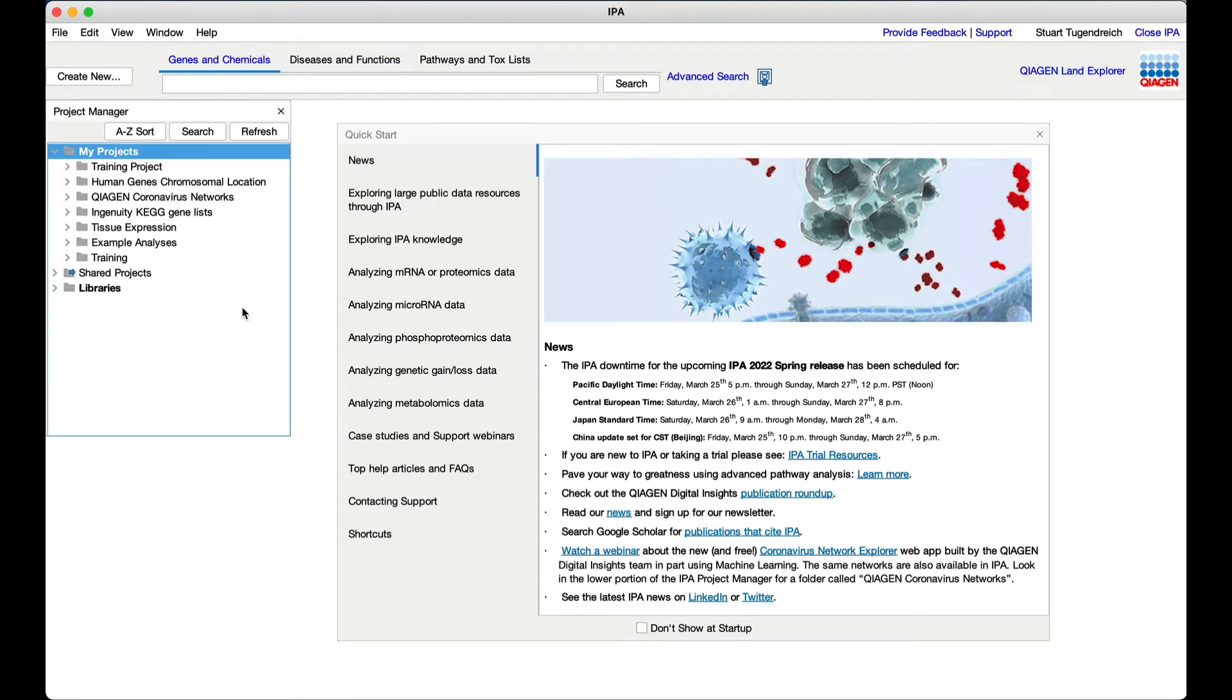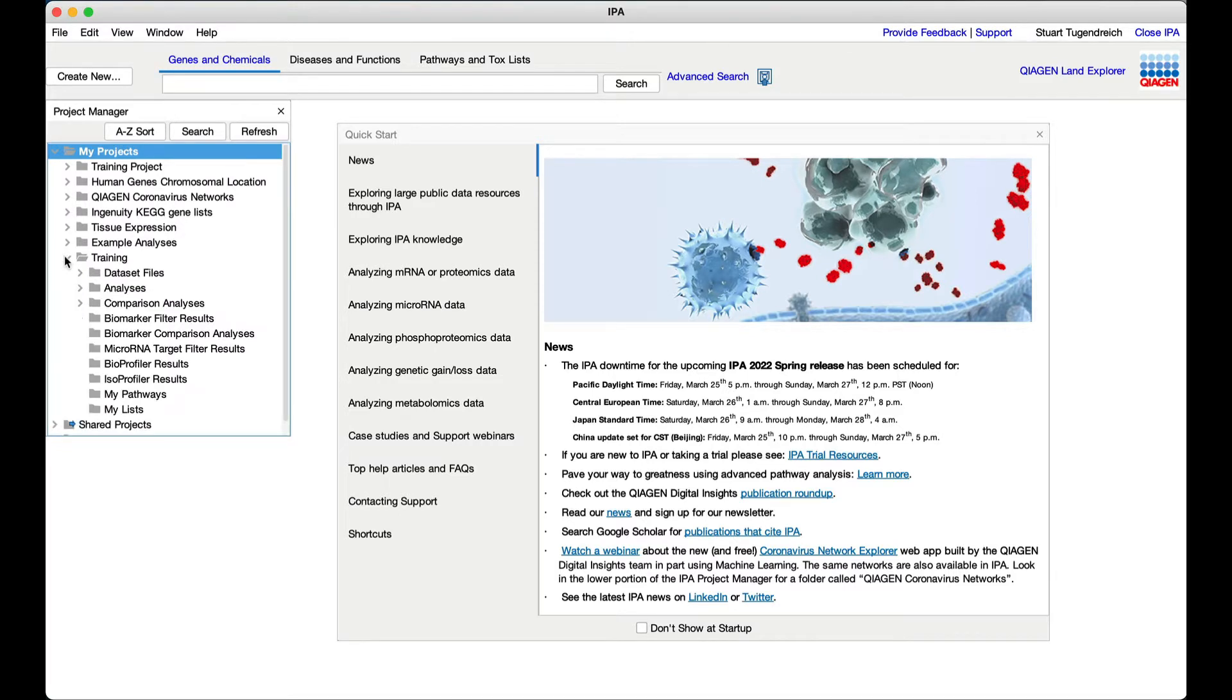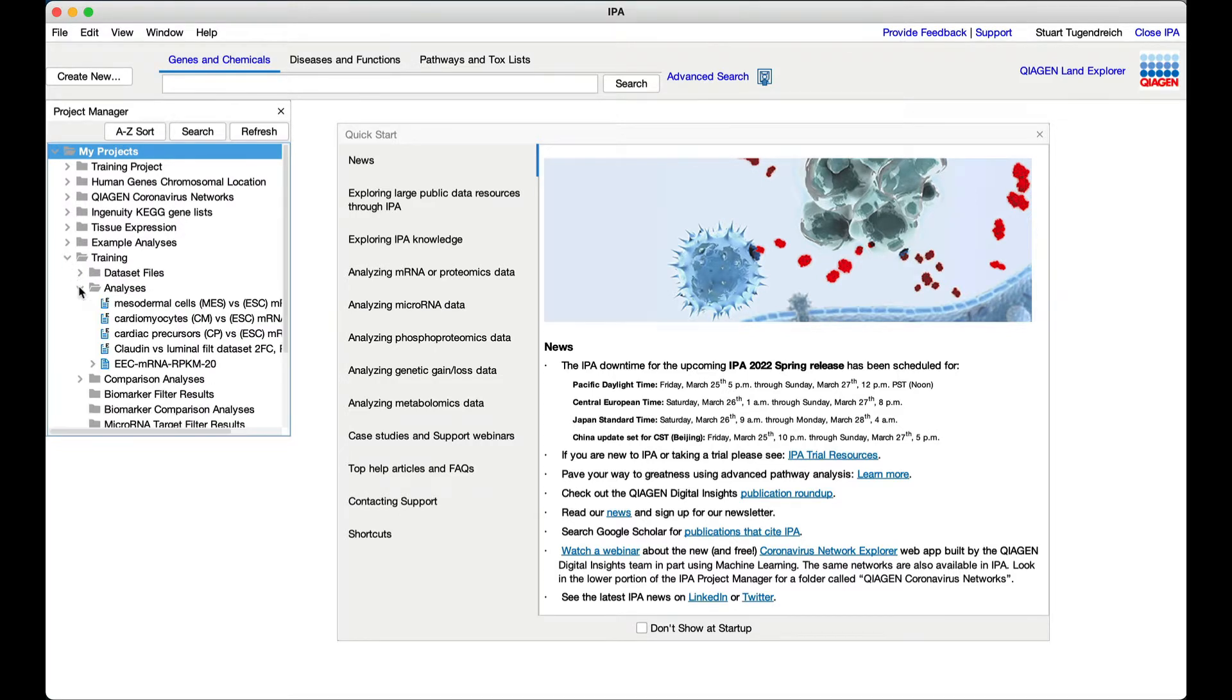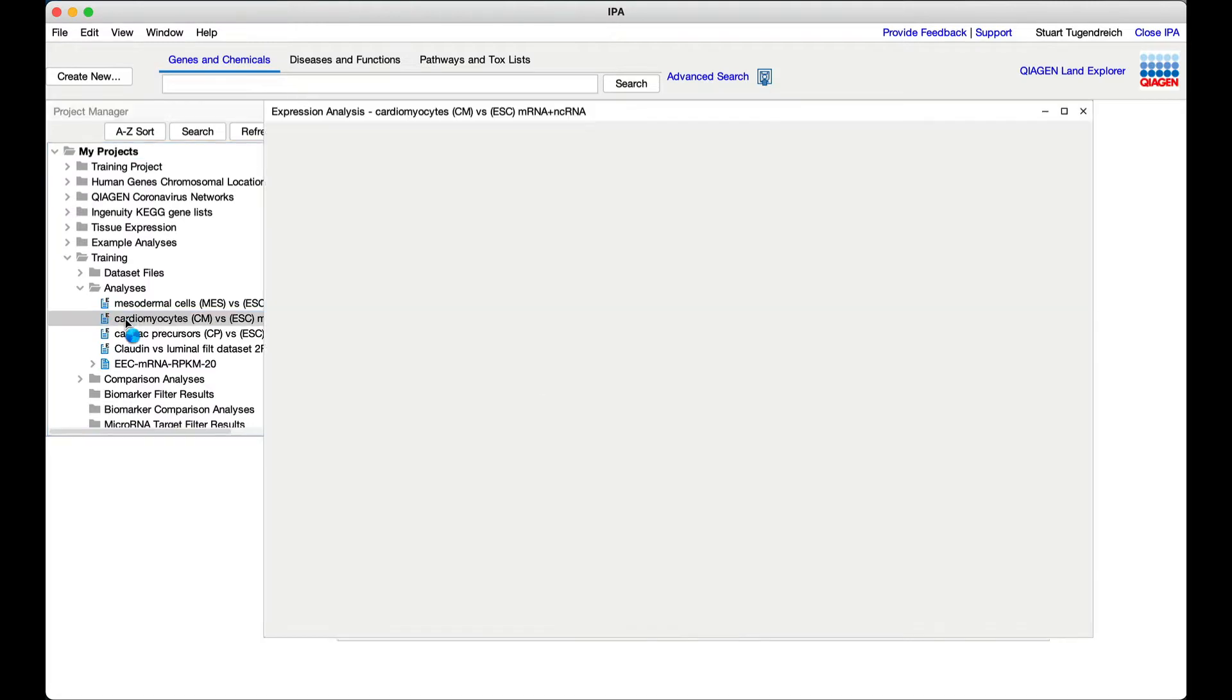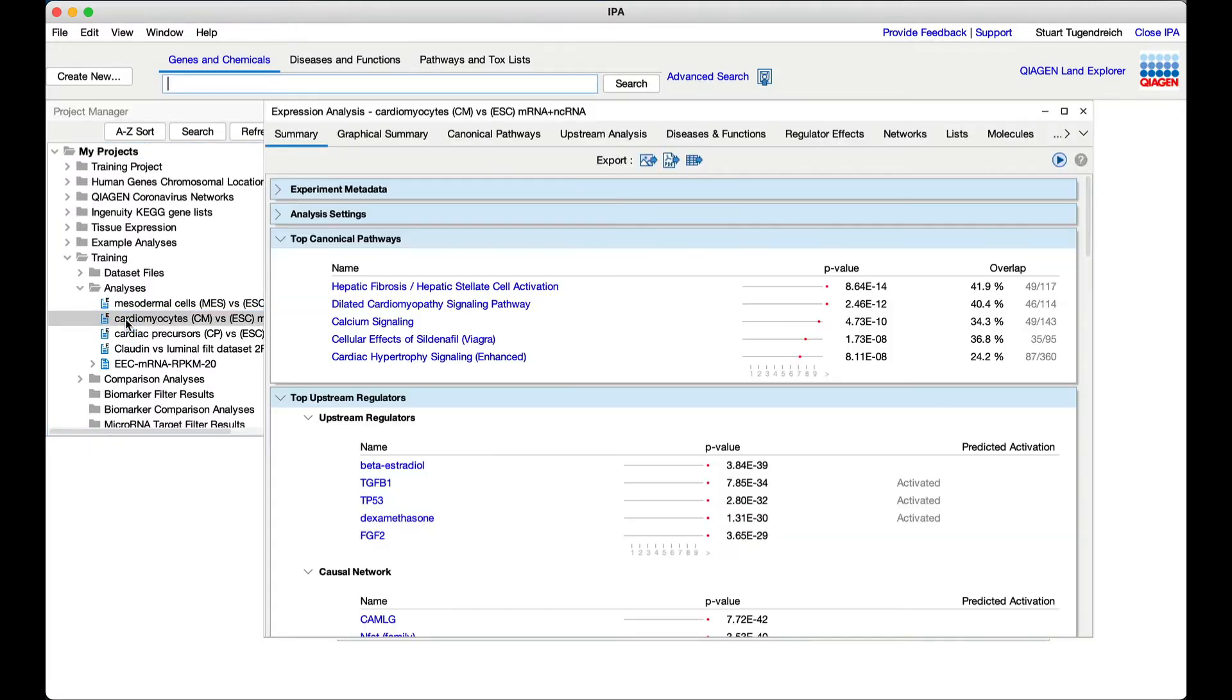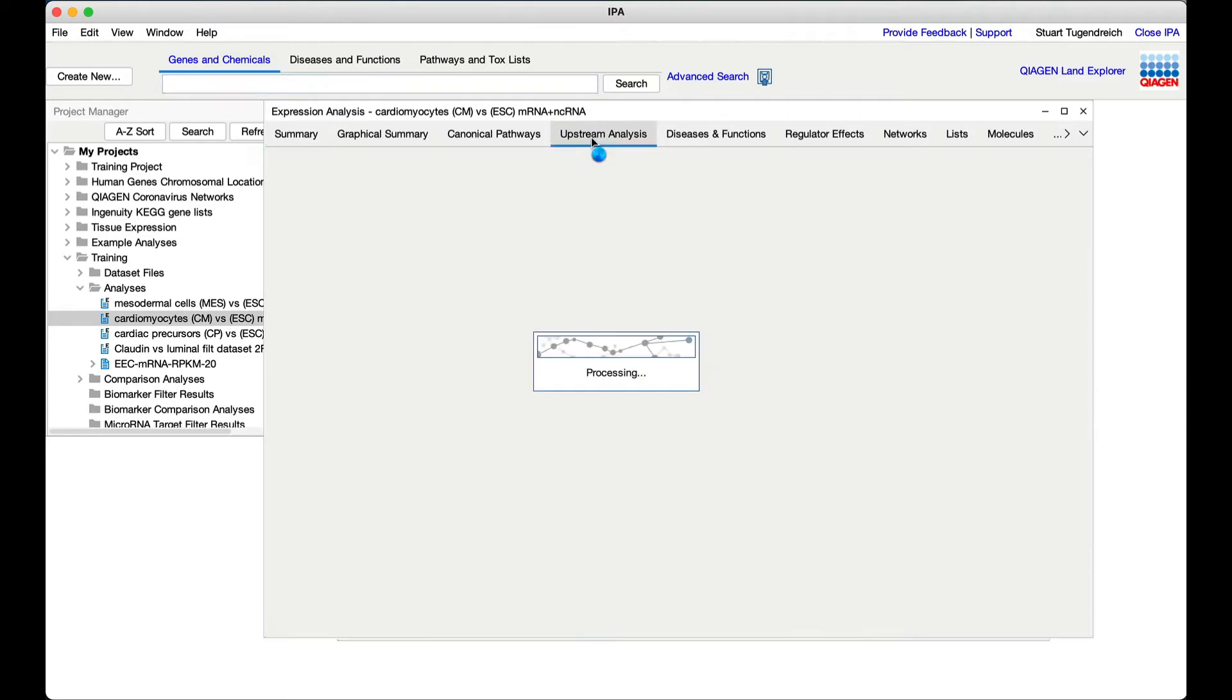Let's use IPA to investigate how an upstream driver might cause a set of transcriptional changes in the differentiating cells. Open the analysis of the cardiomyocytes, which are the last stage of the differentiation, with the cardiomyocytes beating in vitro.